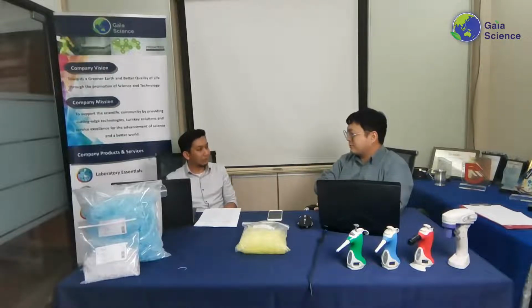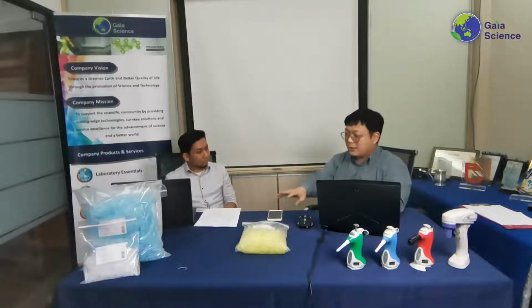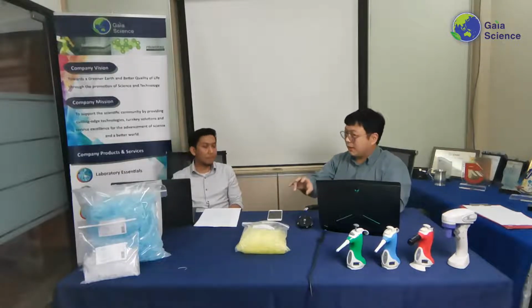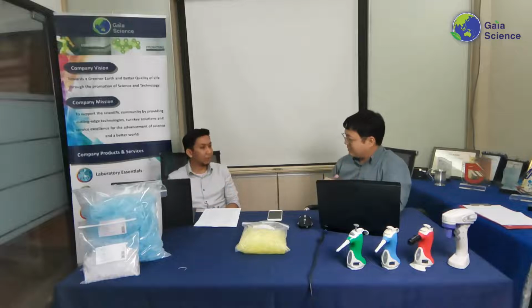I see. So that is one of those areas where it can be concerning, and it's sometimes out of your hands as well, in that sense. I would also say that autoclaved tips, which you buy in bulk, are not 100% RNase- and DNase-free as well. So sometimes, if you're working with certain sensitive assays that involve DNA and RNA related work, it's better to get sterile ones.